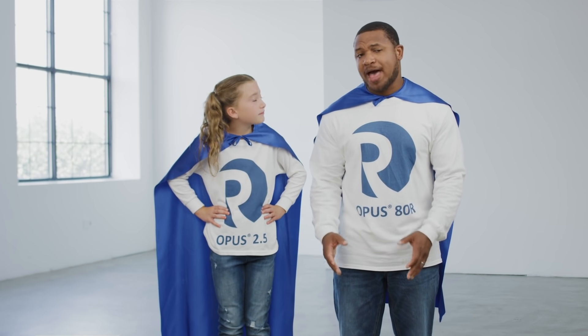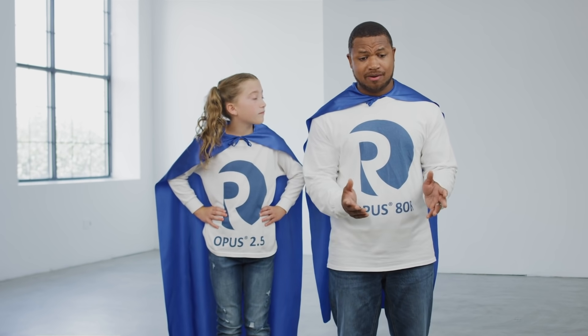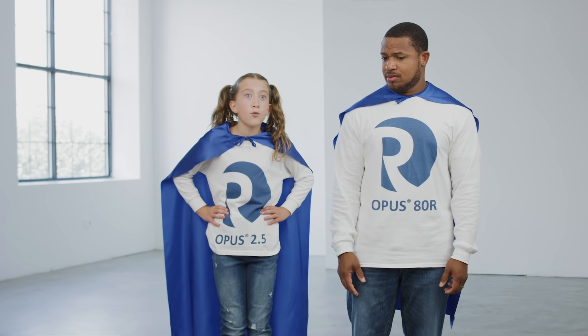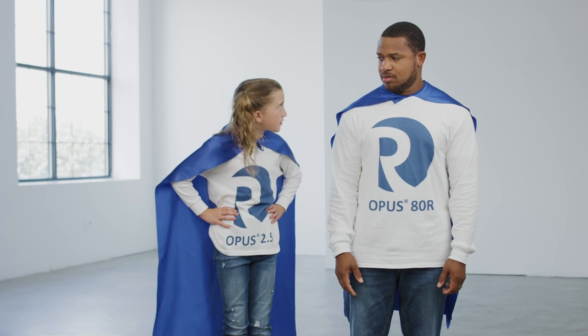The Opus 80R can be packed with over 150 resins — that's nearly any resin from nearly any supplier. The new 2.5 cm column is part of the Opus family, so it also can be packed with nearly any resin from nearly any supplier.